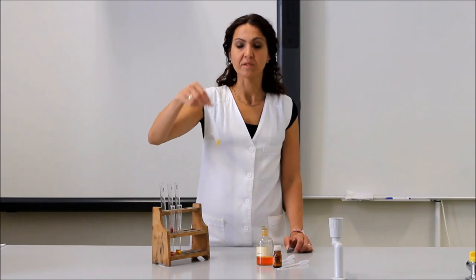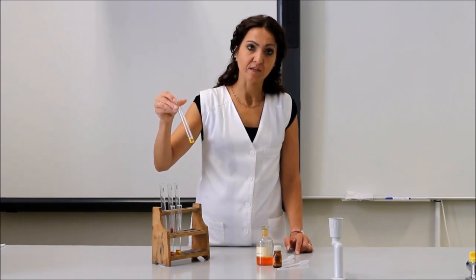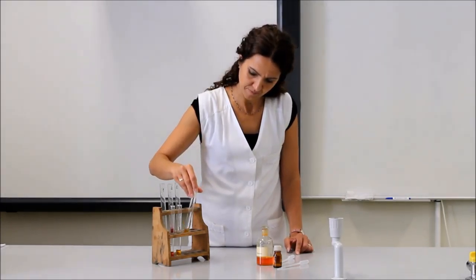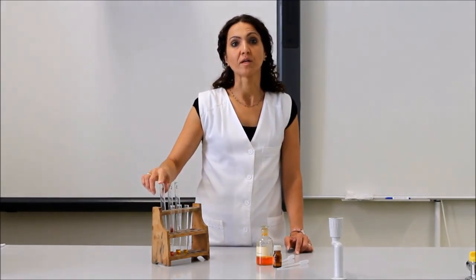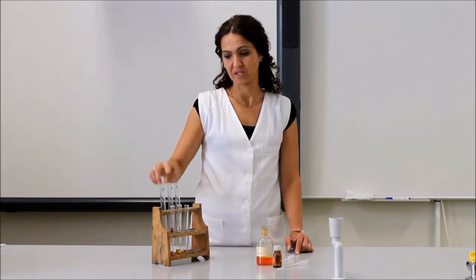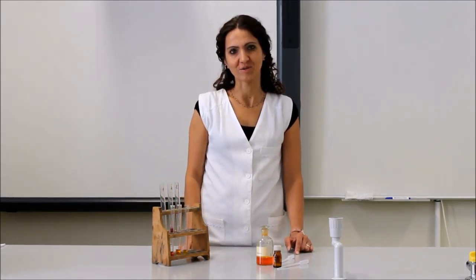A harmadik kémcsőben megint a sárga színt látjuk. Ez azt jelenti, hogy ez a semleges kémhatású oldat. Ezek szerint tehát az első kémcsőben hidrogén-klorid oldat van, a harmadik kémcsőben pedig desztillált víz. A második kémcsőben pedig nátrium-hidroxid oldat van. Viszontlátásra!